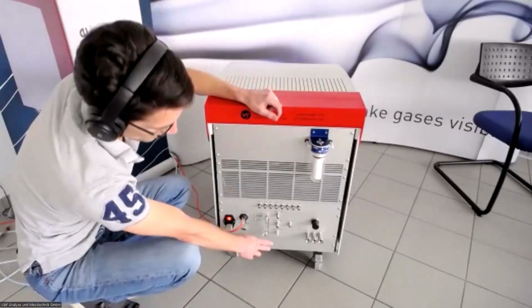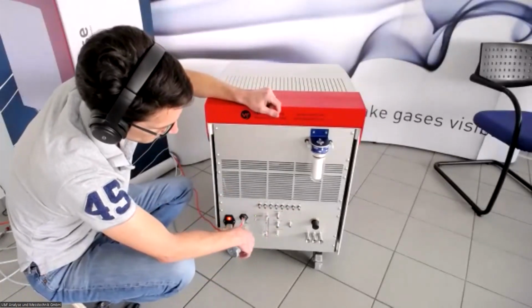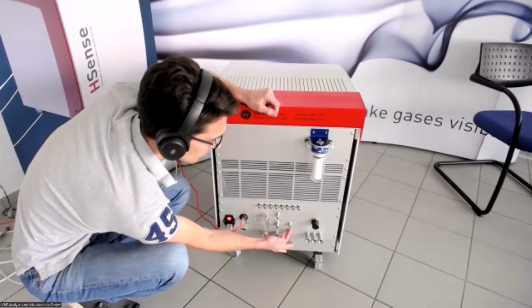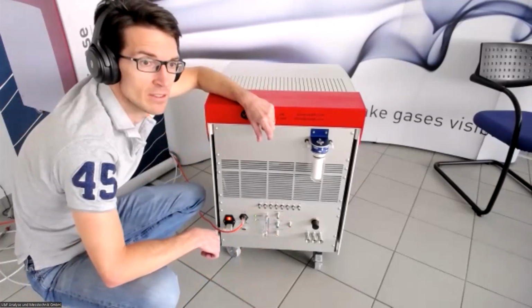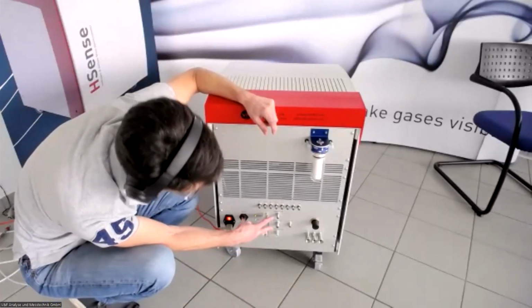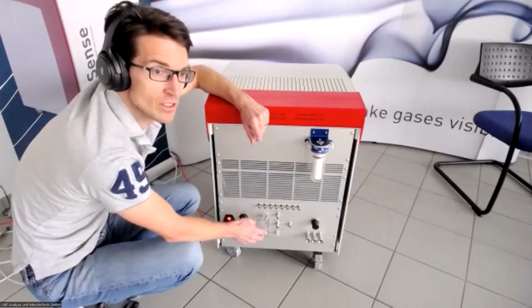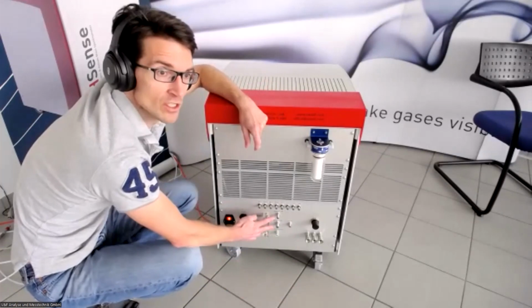The more interesting connections then come here. We have four connections, which are all concerned with gas transfer. The rightmost one is the sample inlet. The sample inlet will be the one that you use to attract the gas from your measurement point. So this is where the gas goes in. Then the two upper ones are the so-called sample out and vacuum out ports. These are both gas outlet ports. This is where you would connect the lines to your exhaust system.